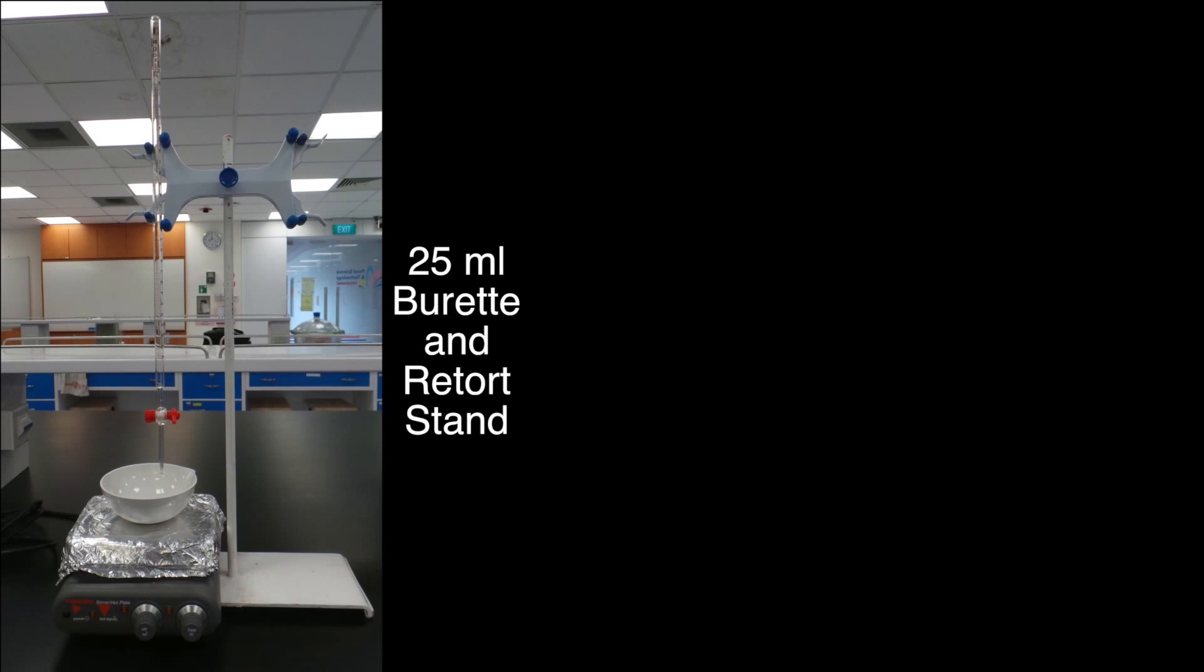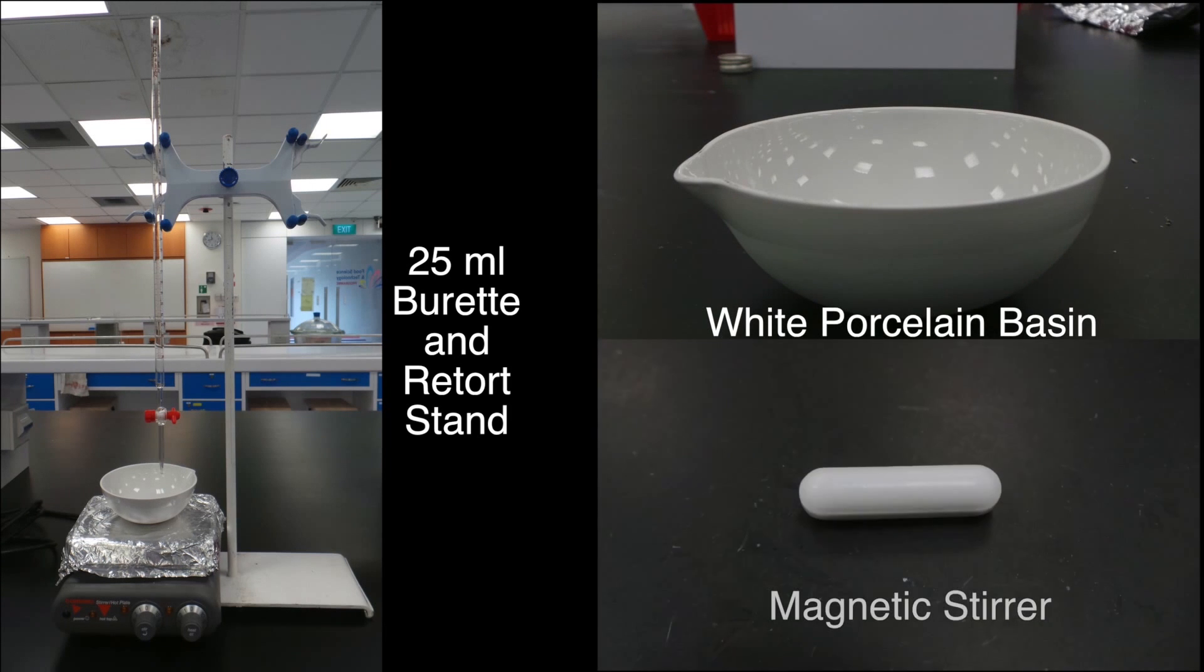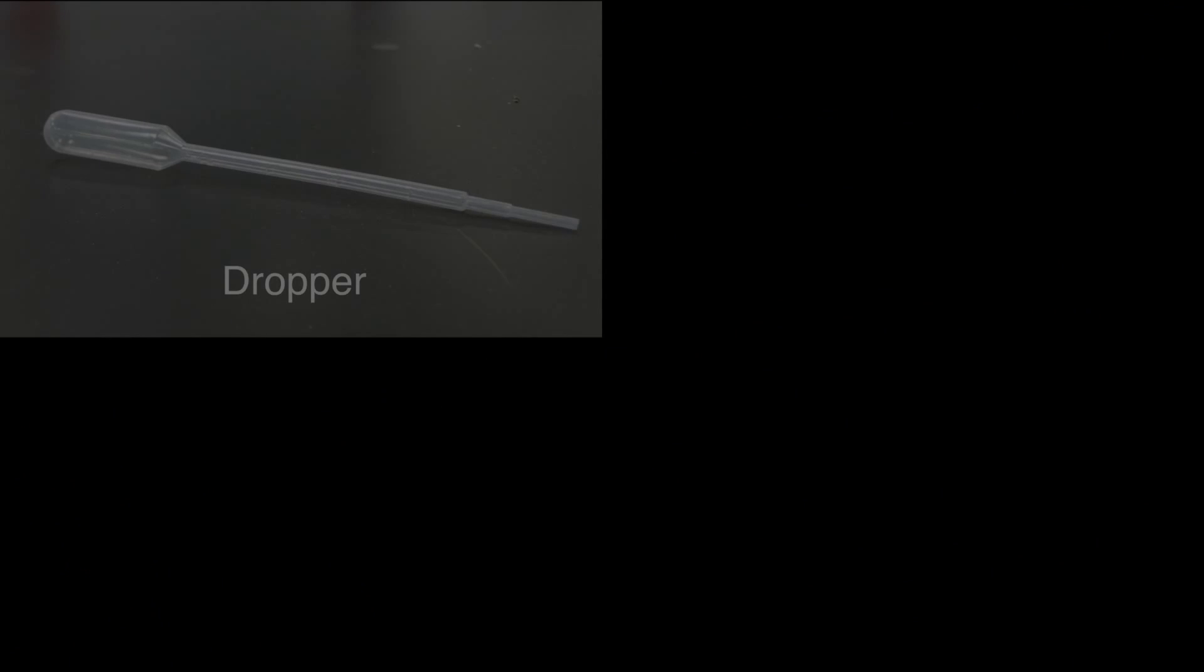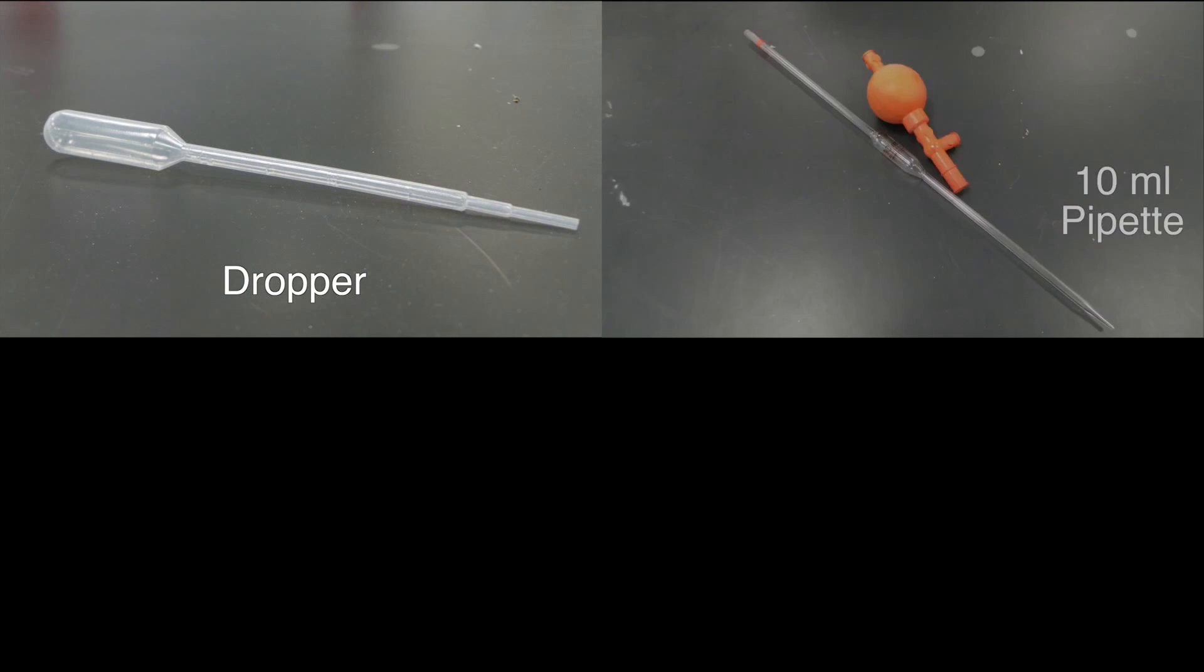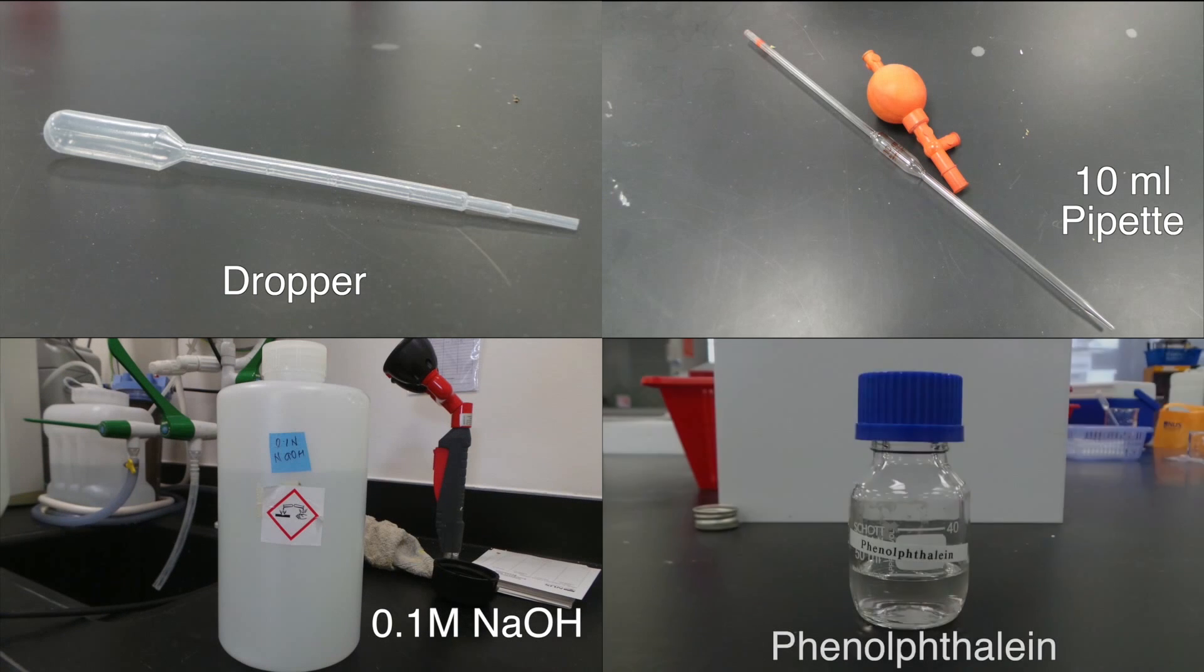In this experiment, the apparatus and reagents needed are 25 ml burette, retort stand, white porcelain basin, magnetic stirrer, plastic dropper, 10 ml pipette, 0.1 molar of NaOH, and phenolphthalein.